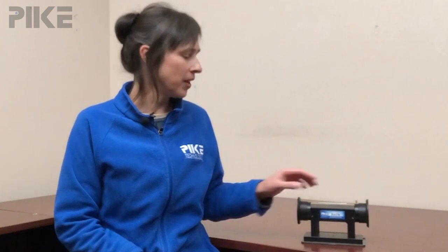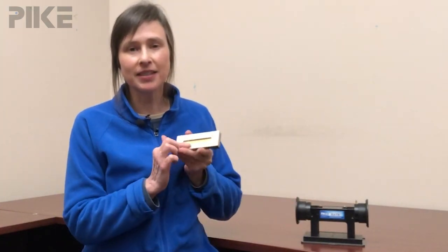So what do you do when you have a zinc selenide plate — you can tell it's zinc selenide by its yellow color — and you have an acid to test? Well, zinc selenide has a pH range between 5 and 9, so we have a problem with an acid.